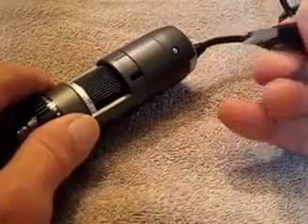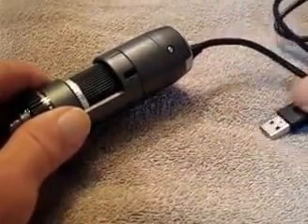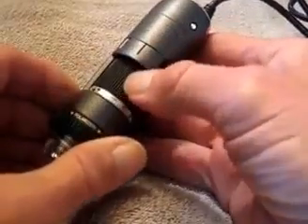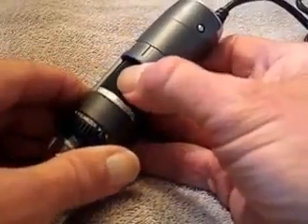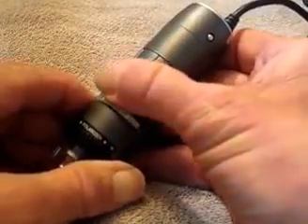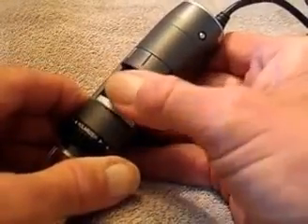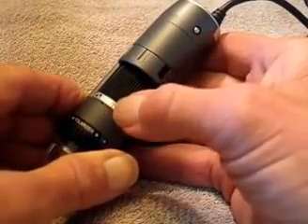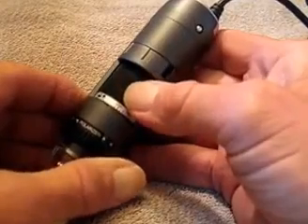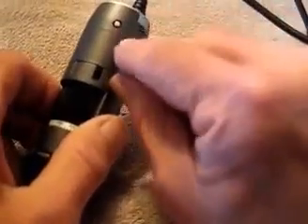It has a USB cable that plugs into a USB port on a PC — I believe these work with a Mac also. Here is the control you'll use the most: the magnification control. You go all the way from the lowest magnification to the highest, which I believe is 240x. The last marked one is 220 but it goes just beyond that scale.